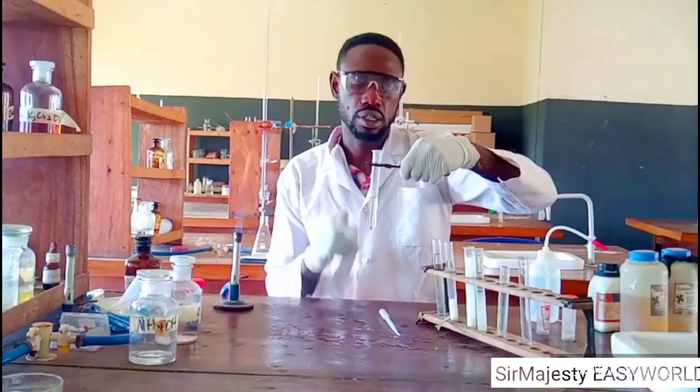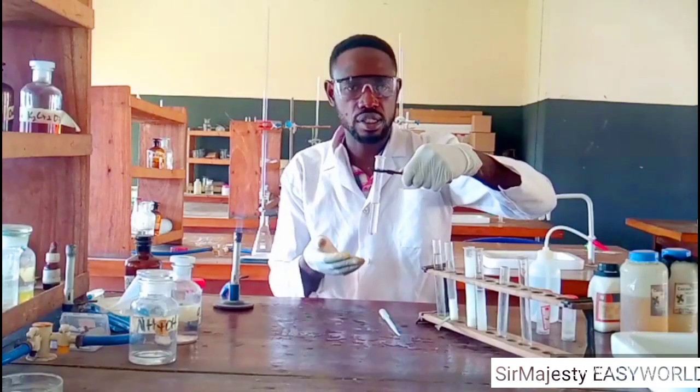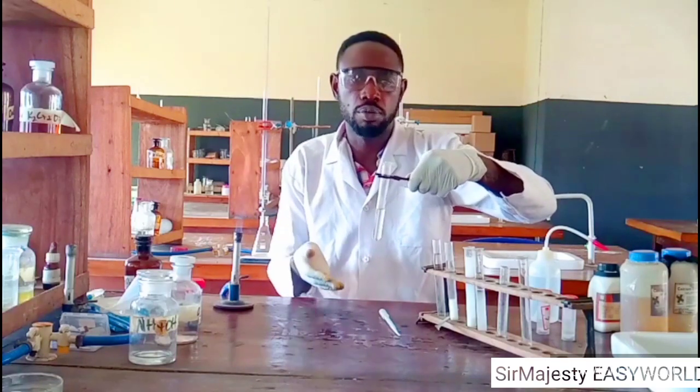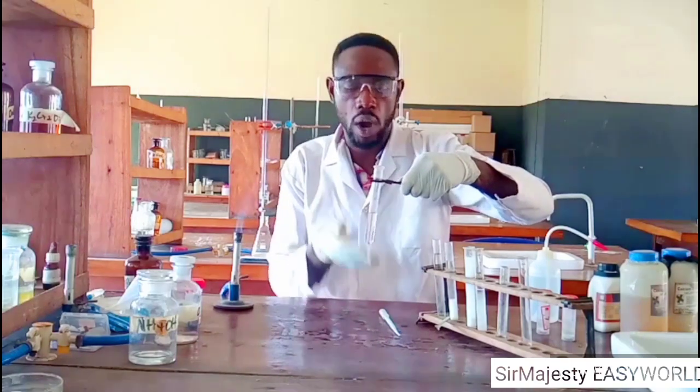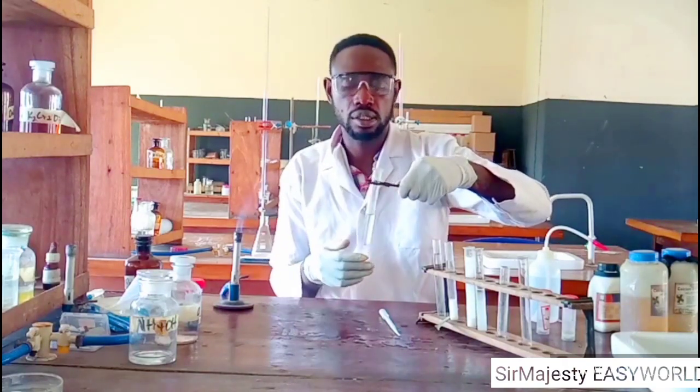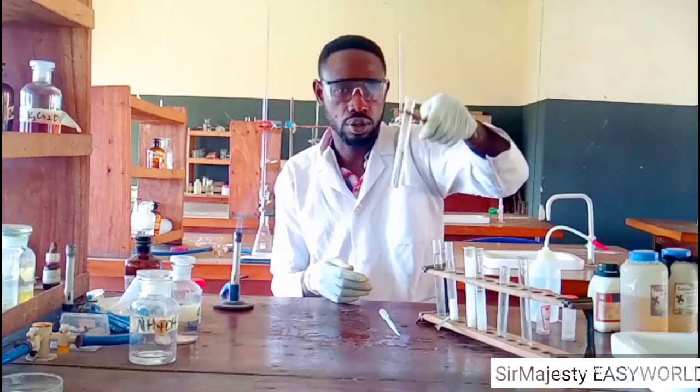So the test might be: sample E plus lead nitrate. Just lead nitrate here, you don't need to add in excess of drops, then followed by heating. The observation is white powdery or white chalky precipitate, which disappears on heating and reappears on cooling.